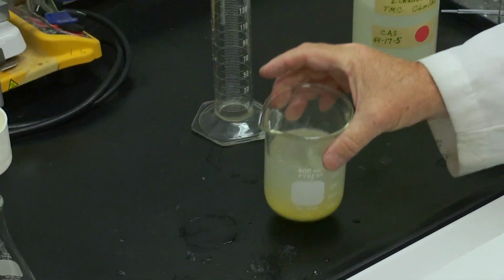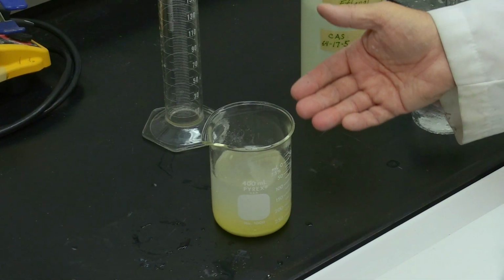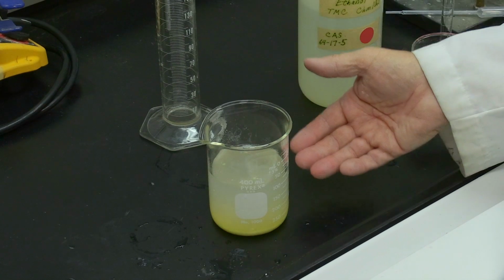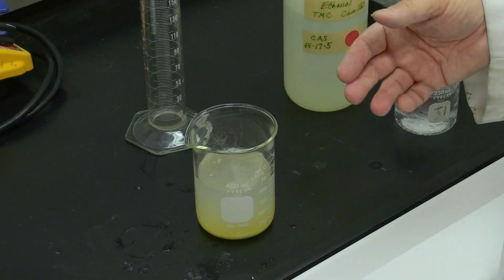Now we just want it to sit for a few minutes. You might have some of the product precipitating out of the solution, and it will add to the amount that we recover.